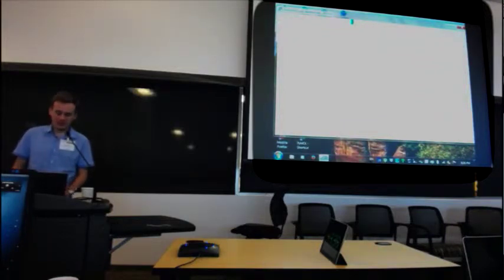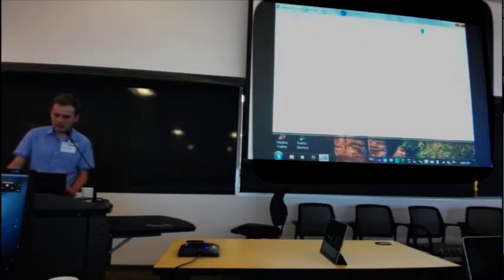Now we have to change the directory to the scratch experimental folder, which is this. I hope that you have your directory with your name inside the scratch folder, so that you can go inside this directory.